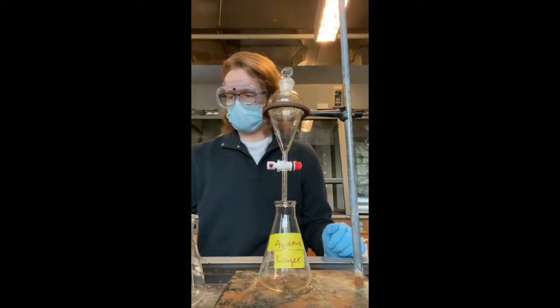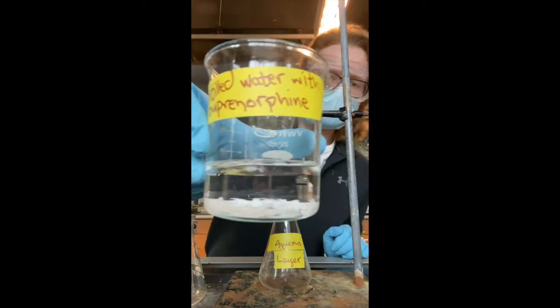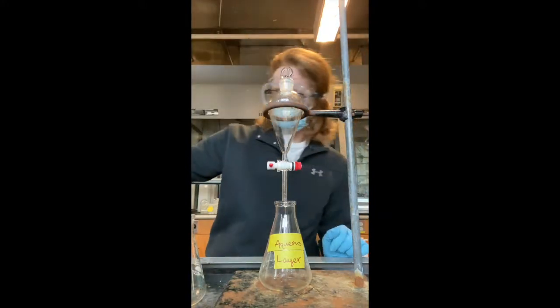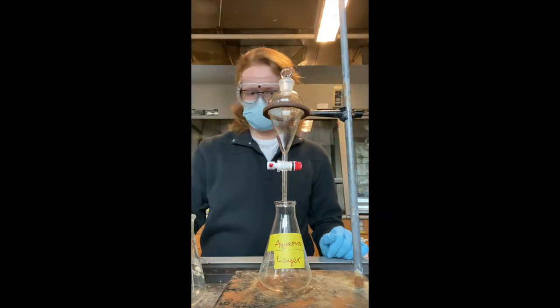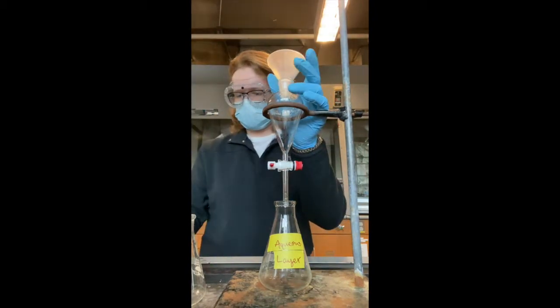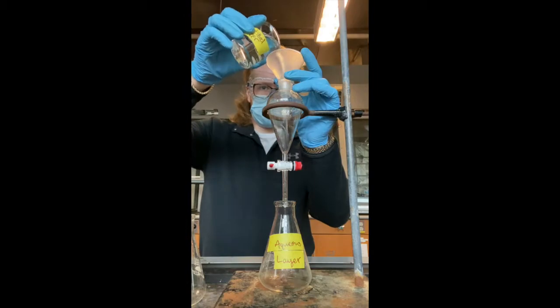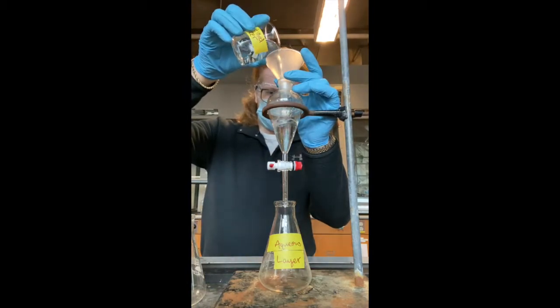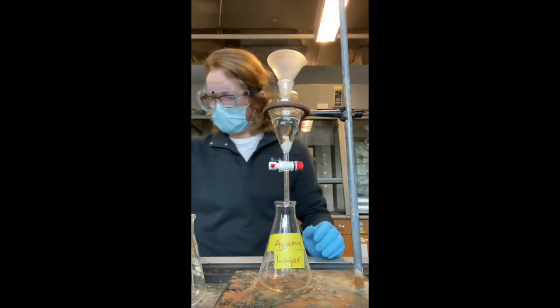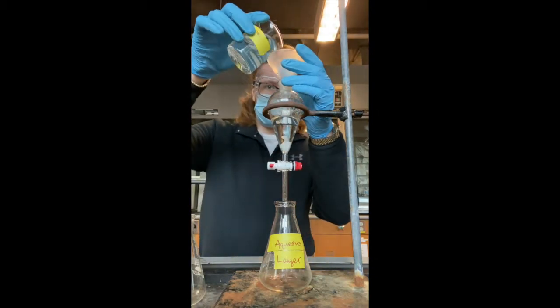To start, I am showing you what the mixture of benzophenone and distilled water looks like. I'm using a separatory funnel to conduct this experiment, and I have a 250 milliliter Erlenmeyer flask placed under it to allow myself to quickly drain out the aqueous layer. As you can see, I am pouring distilled water through a funnel and into the separatory funnel. I then add the benzophenone, followed by the hexane solvent.